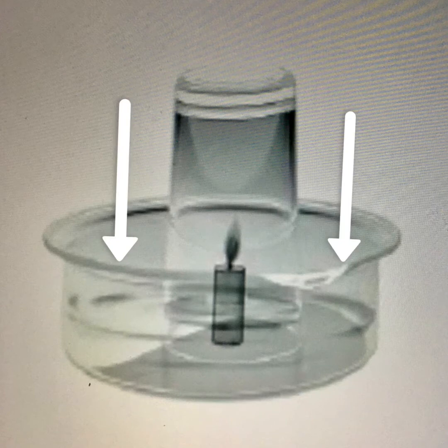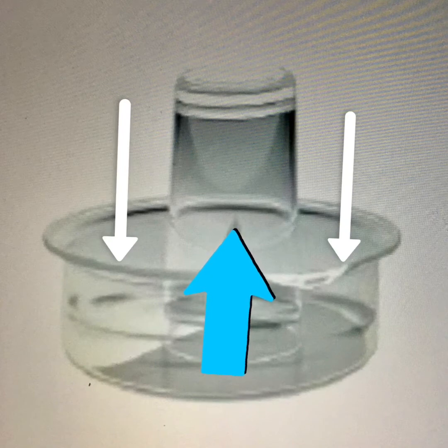Then atmospheric pressure pushes the water in the trough. Water enters the glass and fills up that vacuum. We know that the vacuum was created by utilization of oxygen, and the water level in the glass should be exactly 1/5 part. Let us prove this by doing a small experiment.